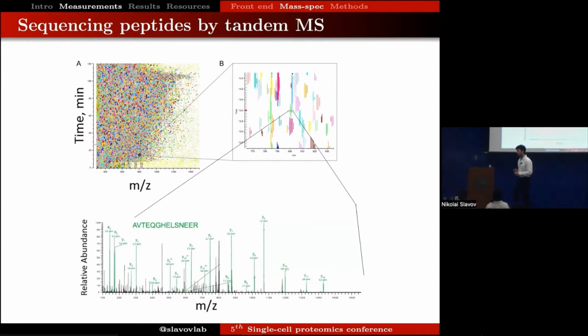But at this point, if you're following the description, and if I'm describing the situation well enough, you might be asking yourself, how can we possibly analyze all of these tens of thousands of peptide-like features if we're going to be fragmenting peptides one at a time? Because it takes time if we're doing this serially. And this is really one of the key things to understand, to enable you to understand much of the progress happening in the field. What are the various solutions, computational and otherwise, that colleagues are coming up with to deal with this challenge, to be able to determine the sequences of all these peptide-like features that you're detecting. And I would say that, at least in my opinion, having the information from the MS2 fragments is very useful, and traditionally has been the most reliable way of determining the sequences with confidence.